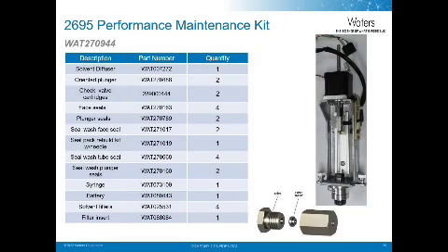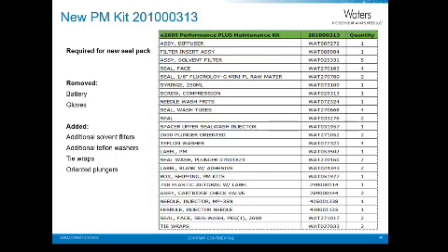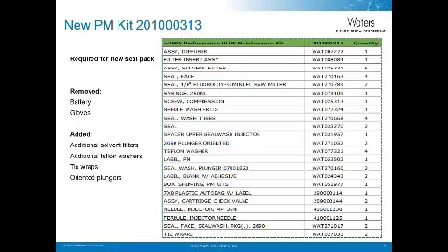This is the PM kit for the original and Phase 2 injector. This is what you will change during that PM. There is also a new E2695 Performance Plus PM kit. The part number is shown here.